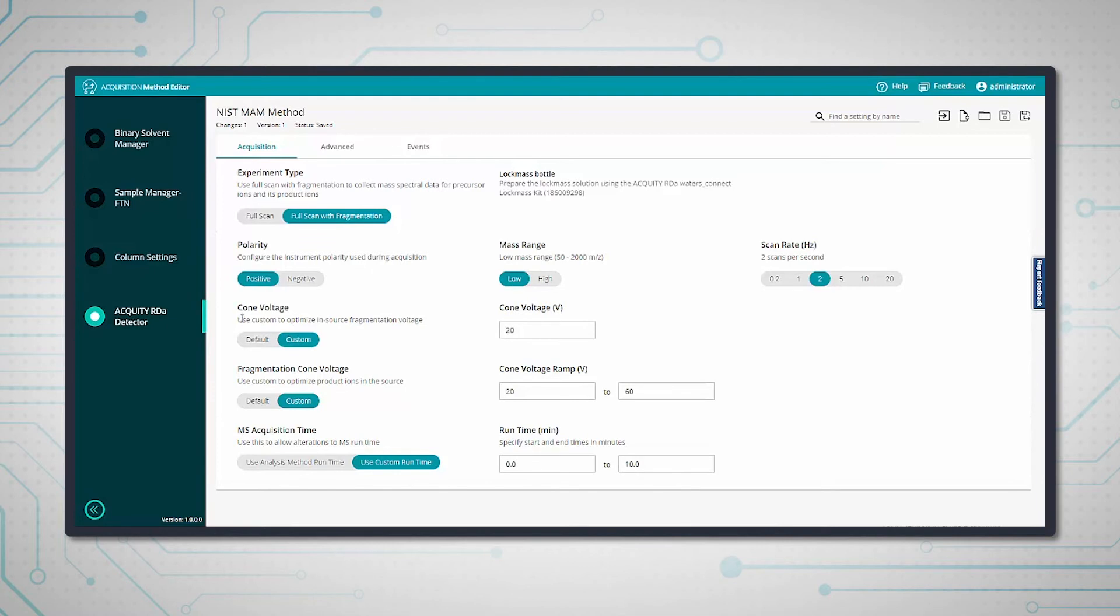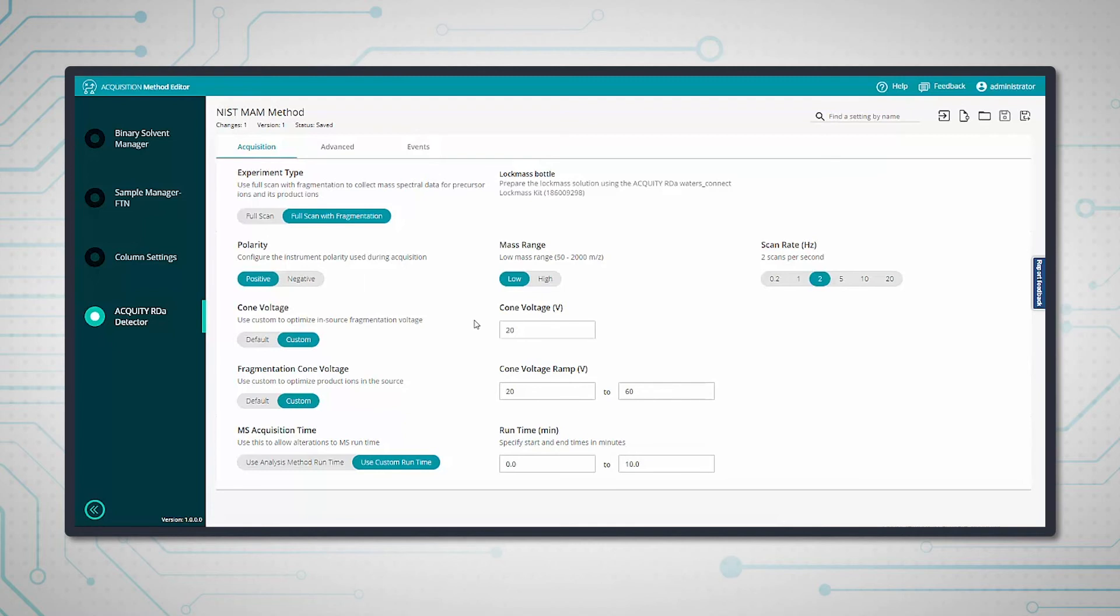We have the mass spec settings - the ACQUITY RDa settings. This is a full scan with fragmentation experiment where we're doing high-low fragmentation switching to generate the fragment data as well. It's basically a standard method for peptide mapping or peptide mam. We can change the method here, save it, or open another method, but I'm going to go back to sample submission now.